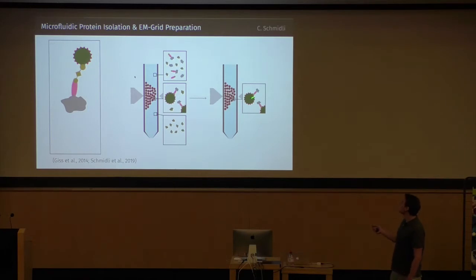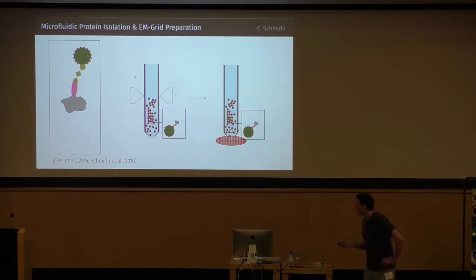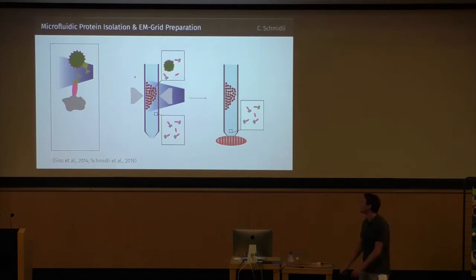Once bound, your target protein can then be written directly onto a grid, and the superparamagnetic nanoparticle can be used as an electron-dense label, or prior to grid preparation, it can be cleaved off by the UV LED, which is also built into the setup.